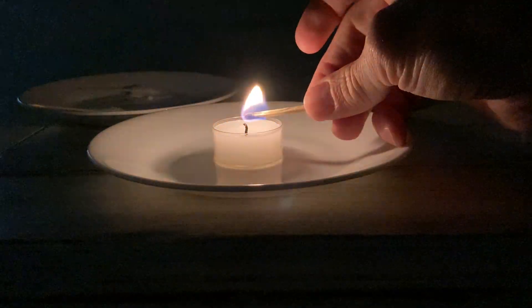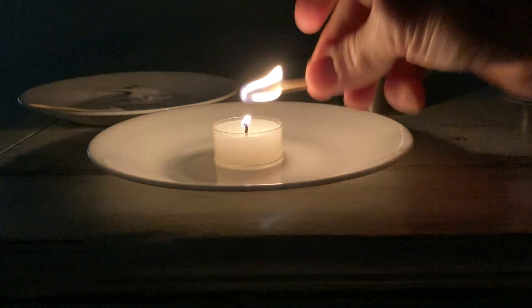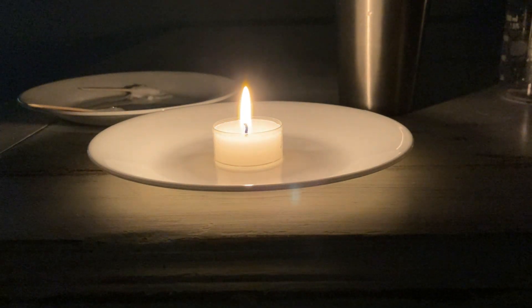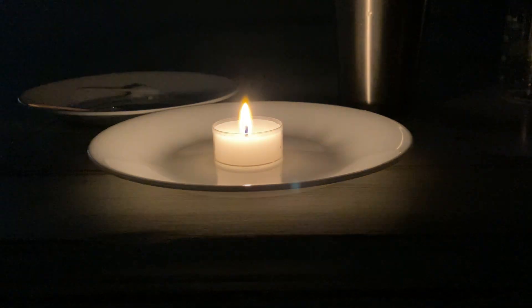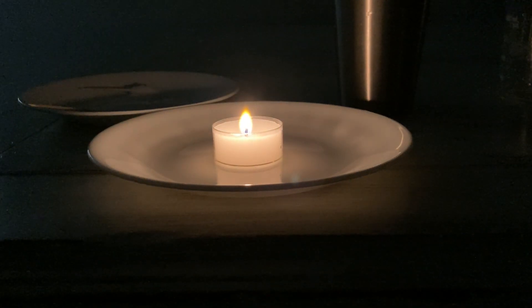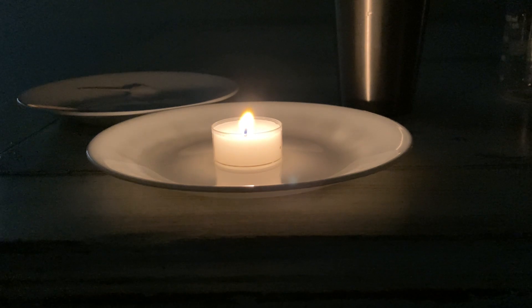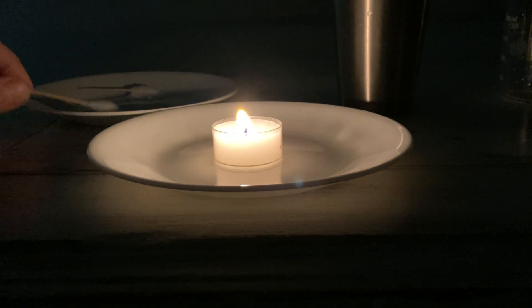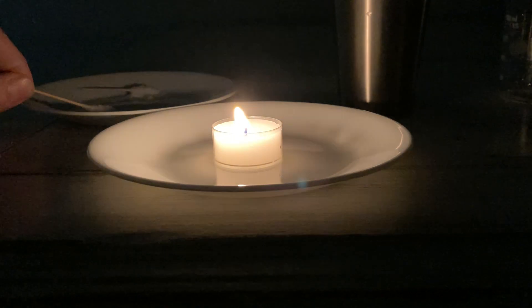You guys can't see anything right now — I should have lit the flame first. Let me put my match away somewhere safe and get my flame going. Okay, here's my table salt swab.